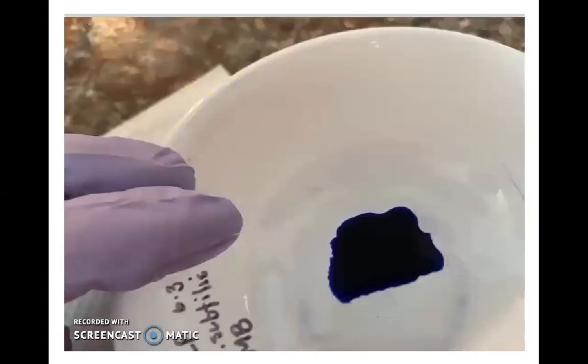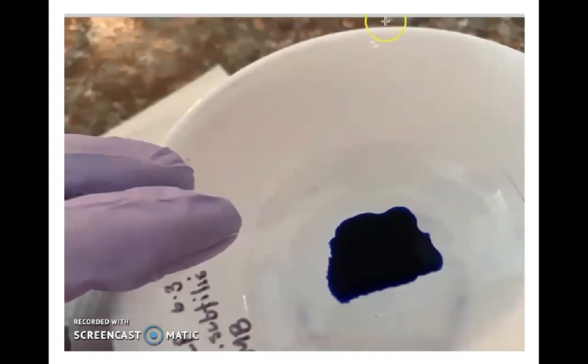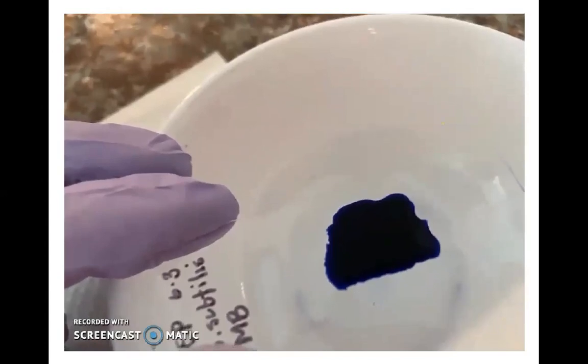Now, don't be stingy with stain. You want to make sure that whole smear that you took the time and trouble to make is covered with that stain. So put the stain onto the slide so that it makes a nice puddle. All right? Stain is not expensive. So go ahead and apply it generously. And that way you're ensured that all of the cells will get exposed to that stain.